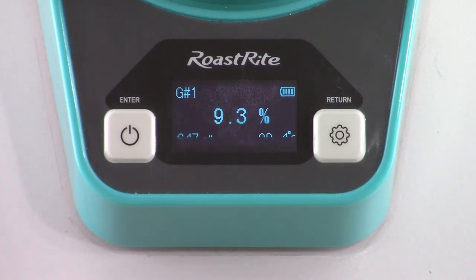Once the measurement is completed, the results will display on-screen, including moisture percentage, density, and temperature.